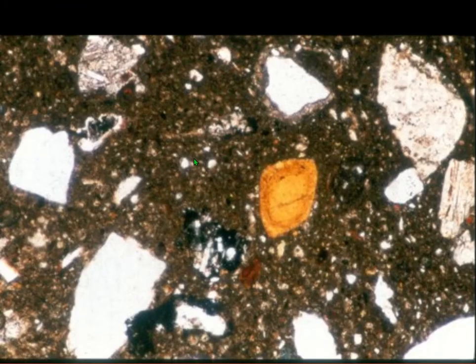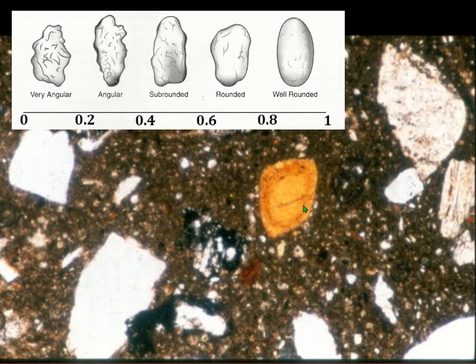And of course we get sand in pottery. This all looks like it's quite natural, subangular to subrounded, and so this is probably a natural deposit in this clay deposit. It's not angular so that it's been crushed. And so this is where we would want to look at these sand grains and say, are they angular, or are they rounded, or well-rounded, or sub-rounded, or angular, or something? And so, of course, don't use this, use the ones I use in the manual.